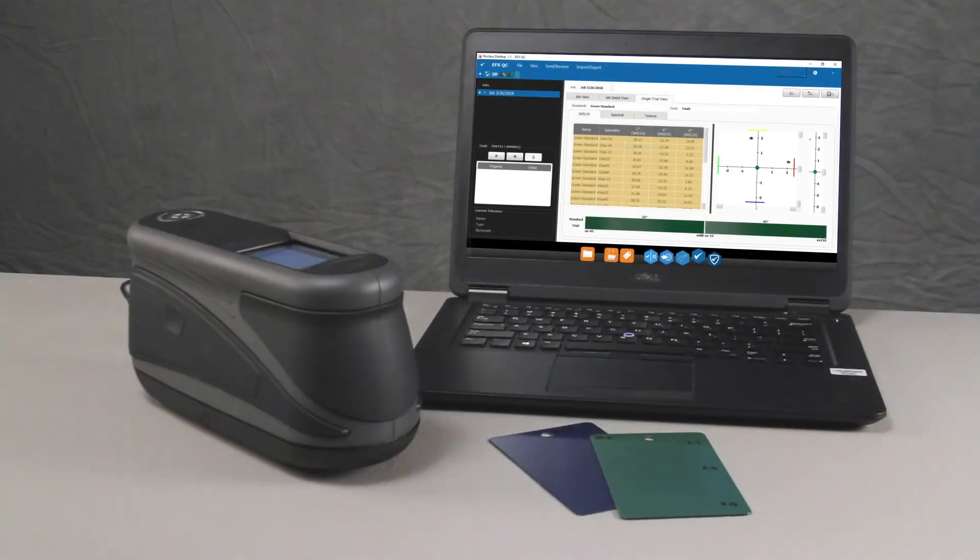The MAT Multi-Angle Spectrophotometer is designed for consistent, precise color measurement of metallic, pearlescent, and other complex special effect finishes.